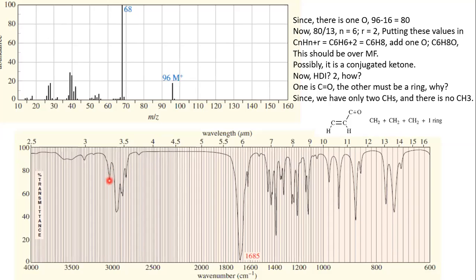And if this is the correct assumption that we have made, then we should have a carbon-carbon stretching here, at 1600 something, and so we have it. So it means that we have a carbon-carbon double bond also here, and the doubly bonded carbon also has a hydrogen with it. Carbon-carbon double bond is indicated by this peak, and sp2 carbon-hydrogen is indicated by this.